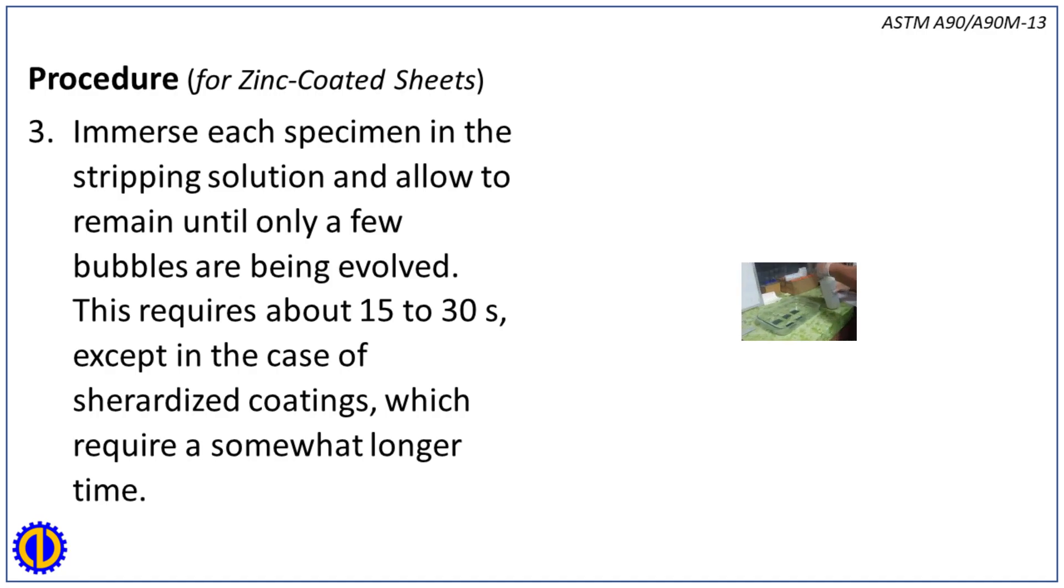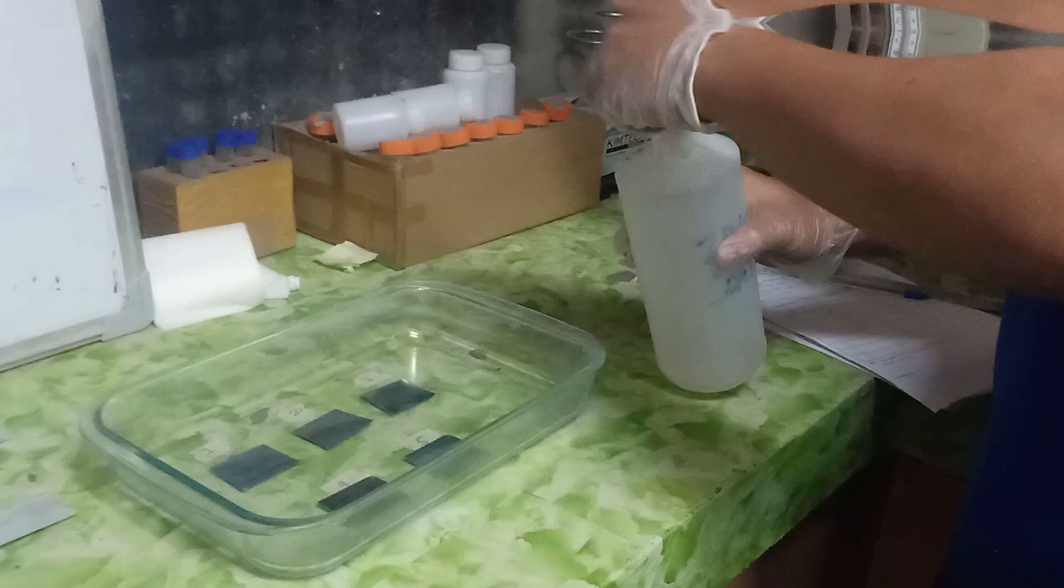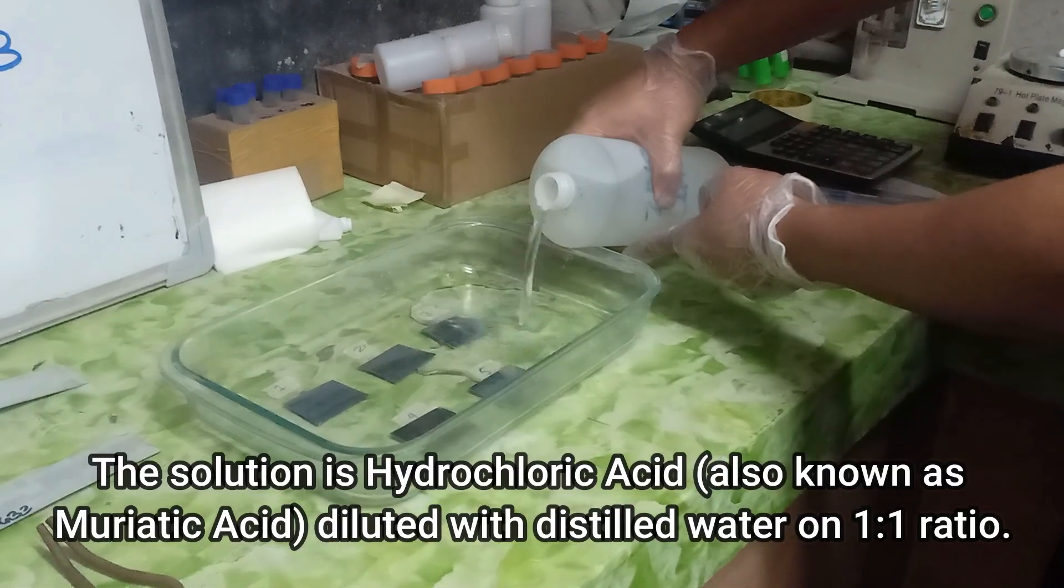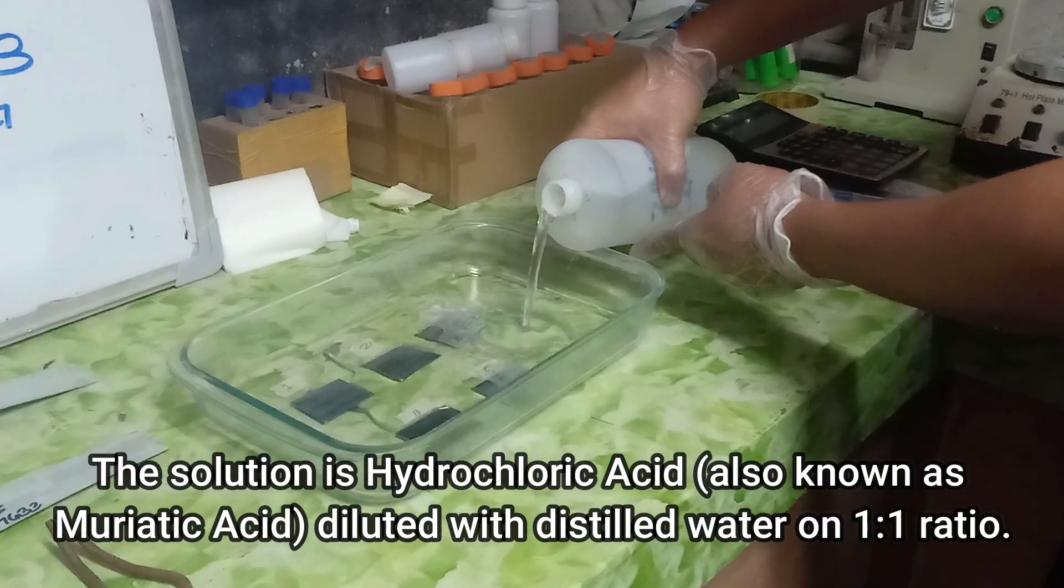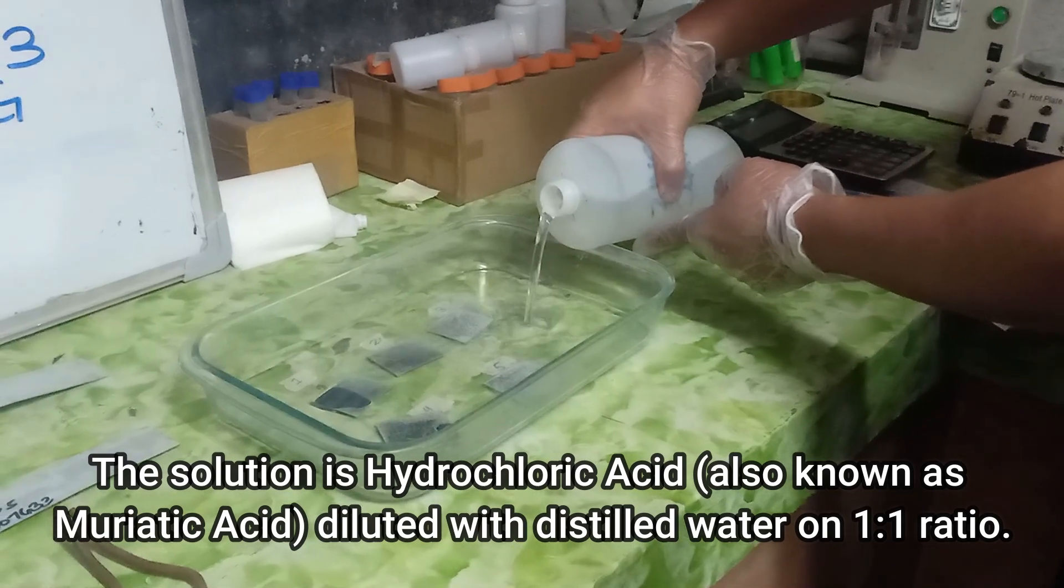Step 3: Immerse each specimen in the stripping solution and allow to remain until only a few bubbles are being evolved. This requires about 15 to 30 seconds except in the case of sherardized coatings which require a somewhat longer time. The solution is hydrochloric acid (also known as muriatic acid) diluted with distilled water on 1:1 ratio.